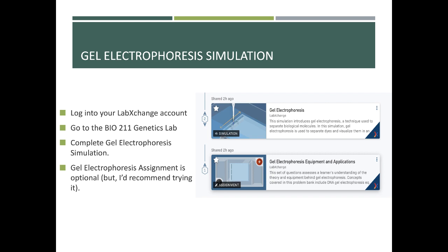A few quick tips I want to pass on to you as you run this particular simulation, because I ran into some problems with it myself. Not really problems, I just didn't know where things were at. Make sure that as you're going through the simulation, that you go through each step specifically. Don't try to skip a step. Go through them just as the lab notebook on the right side shows in order. Otherwise, you might end up having to repeat the whole thing.